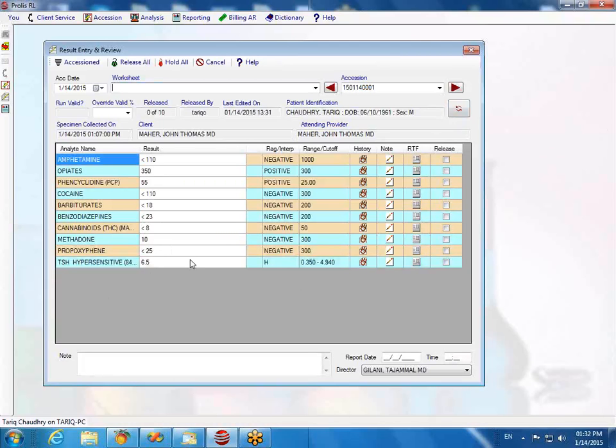Why only methadone need to confirm? Otherwise, you can confirm any of them. It just has to be positive. Yeah, okay, I got you. Any person need confirm you can do it. Yes, just a reminder. It's not just a reminder. Let me put that positive result back and show you what the system does on the report.